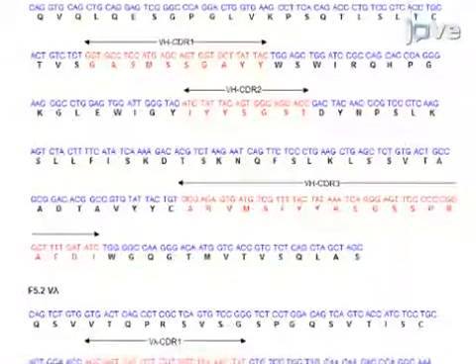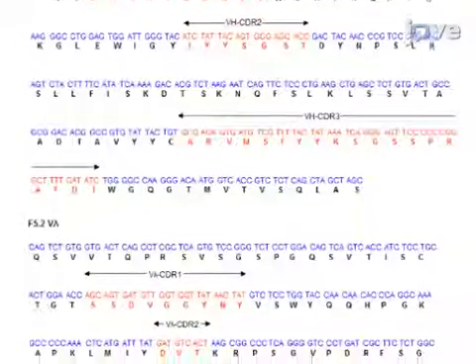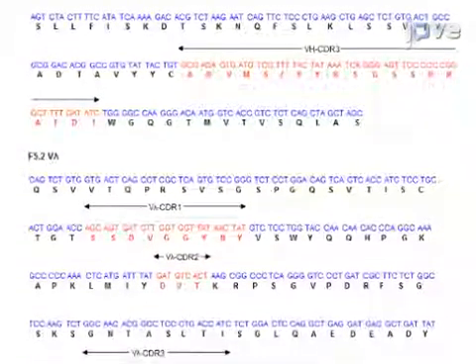Antibodies from a positive clone were sequenced after cloning the immunoglobulin heavy and lambda chain pair. Variable and constant regions of the heavy and light chain could be characterized.